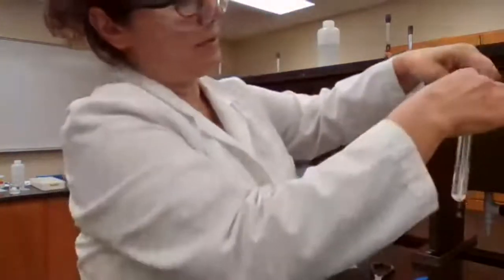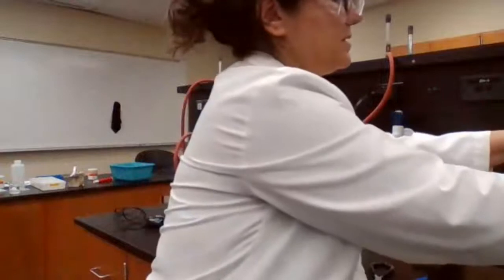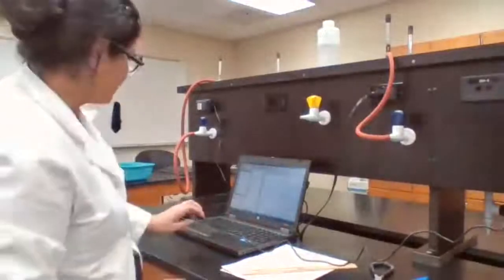I'm going to place the thermometer probe inside the test tube and let it dissolve. I'm going to use this to stir and wait until it's dissolved. As soon as it's dissolved, I can take test tube 1 out of the hot water bath.